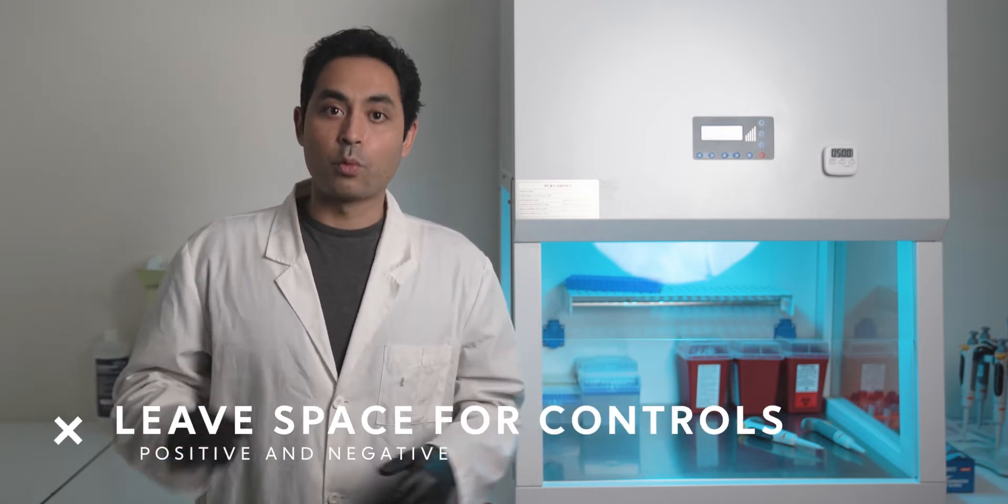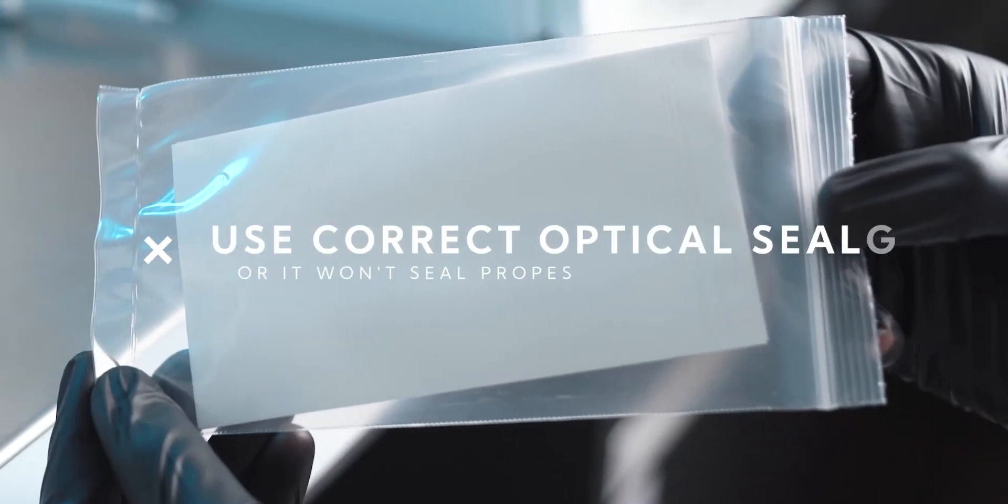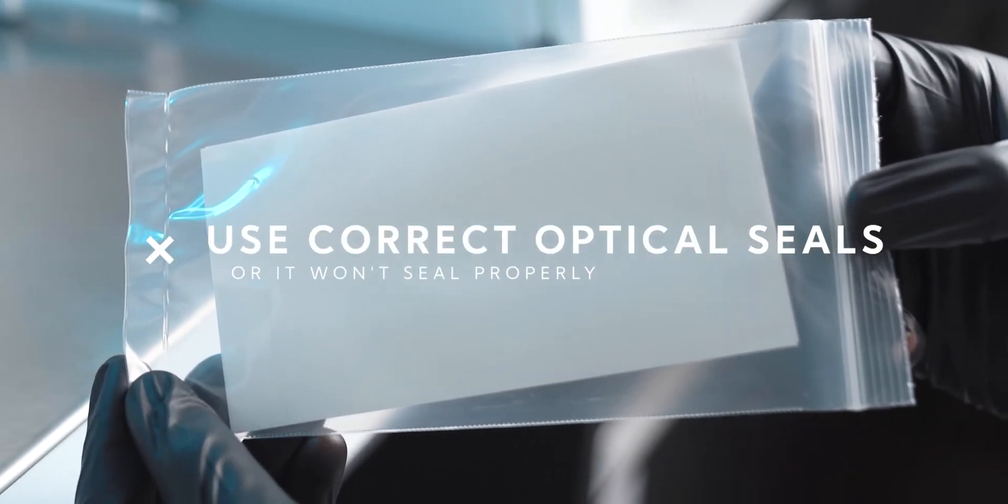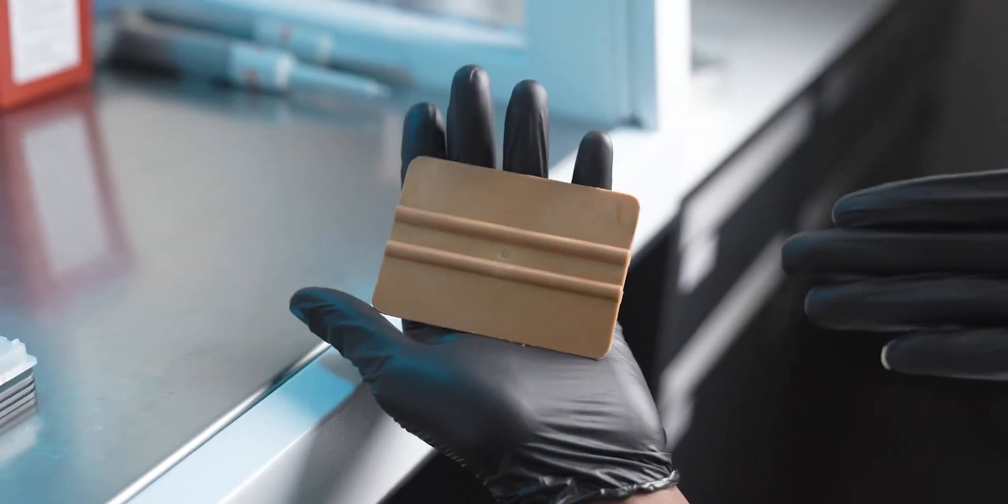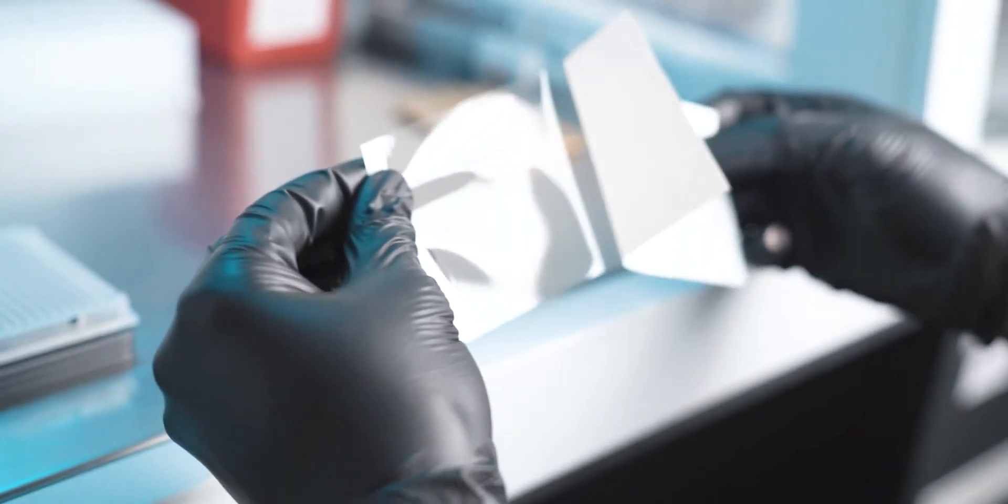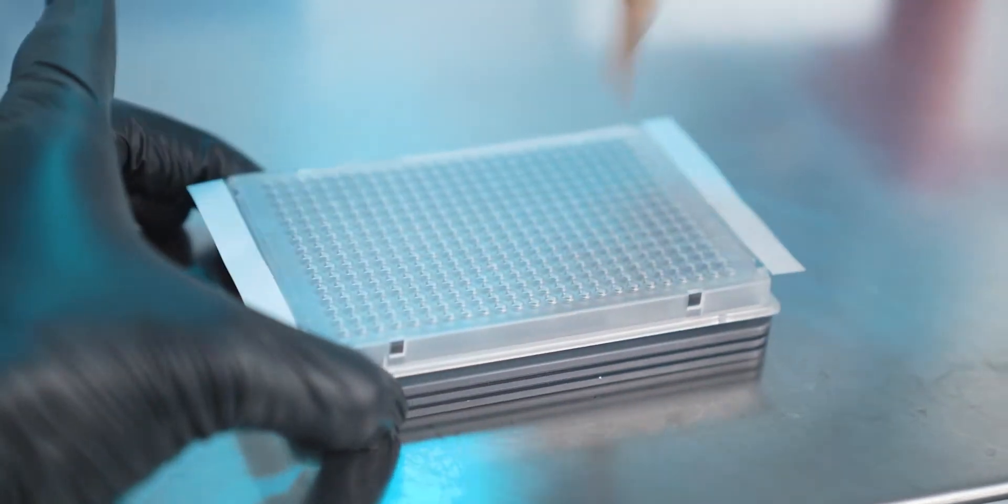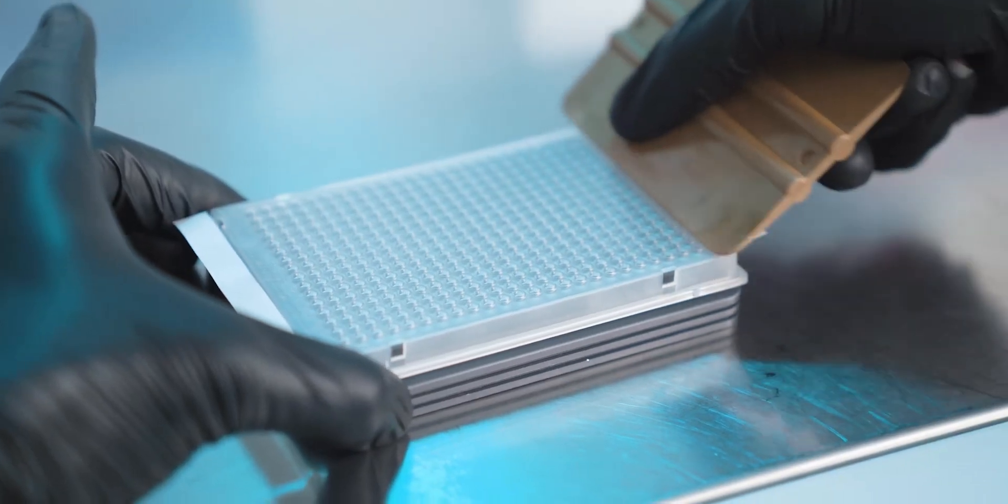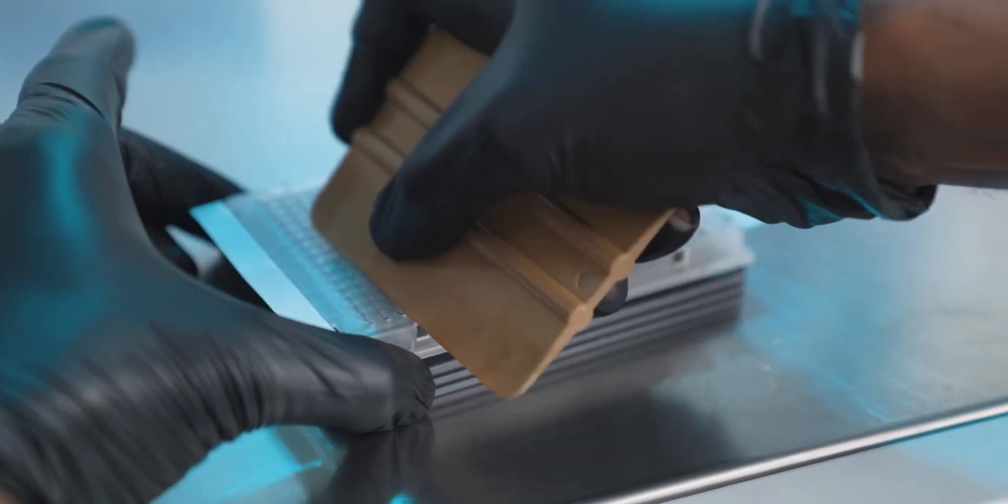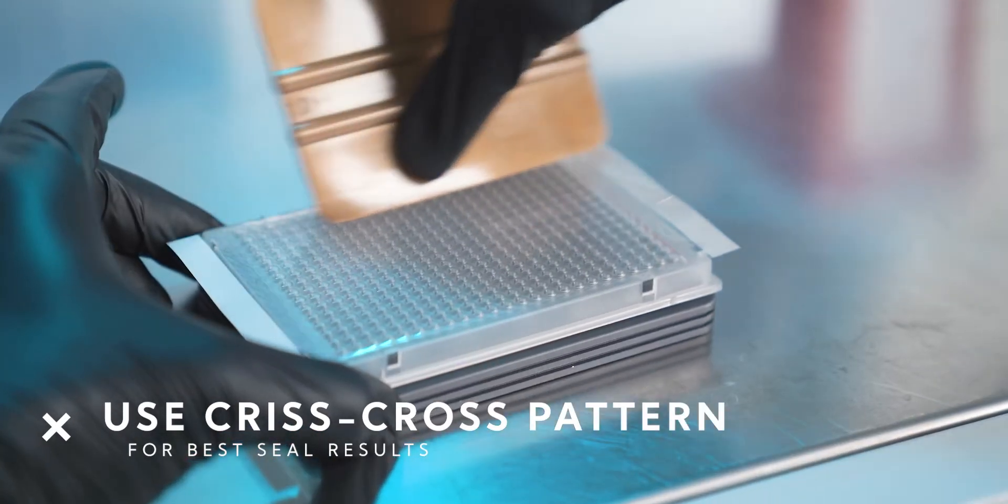When everything is mixed, you want to properly seal your plate. Make sure to use the correct optical seals if you're doing qPCR. You can use the scraper to seal your plate. If you want to get a very good seal, make sure you do a crisscross pattern on the wells.